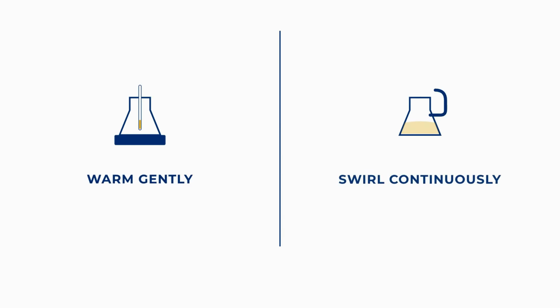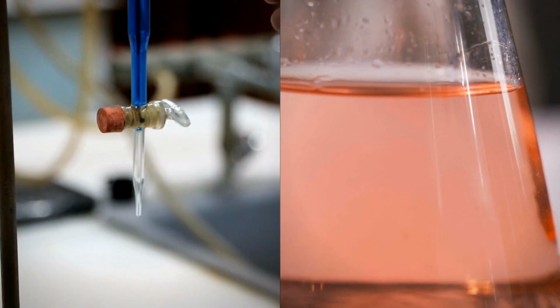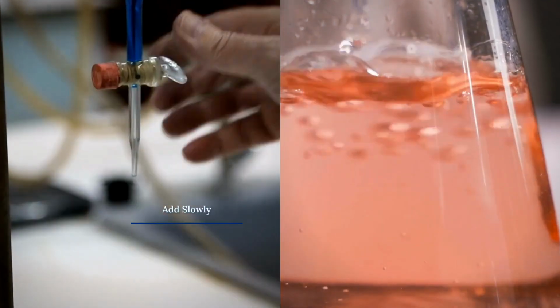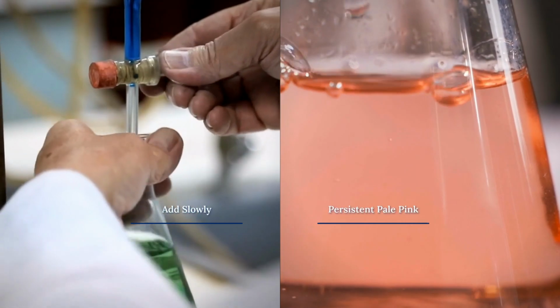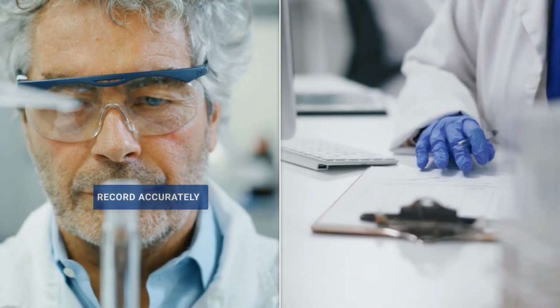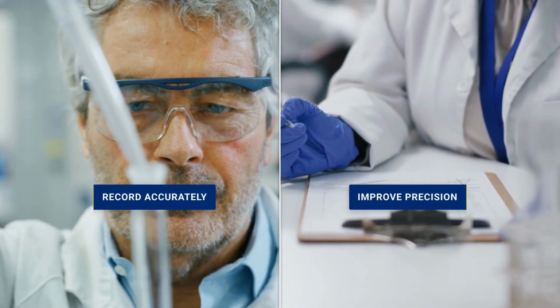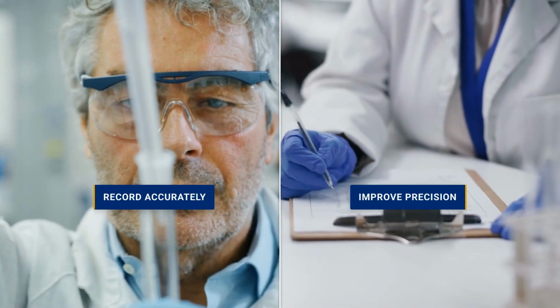Warm the solution gently before beginning and swirl the flask continuously during the titration. Add permanganate slowly near the endpoint and watch carefully for the first persistent pale pink color. Record meniscus readings accurately before and after. Good technique leads to more reliable and precise results.